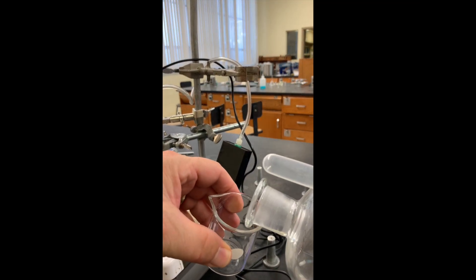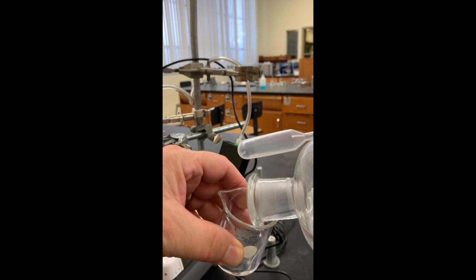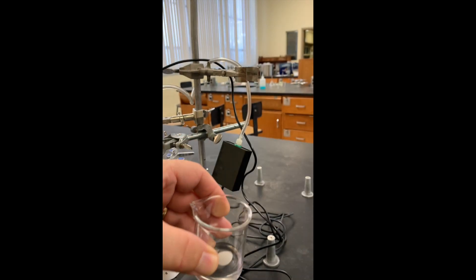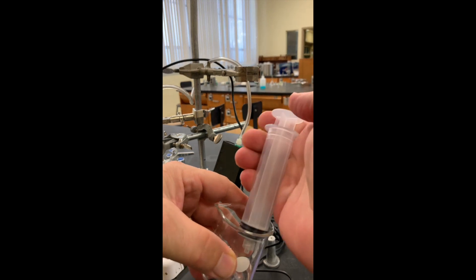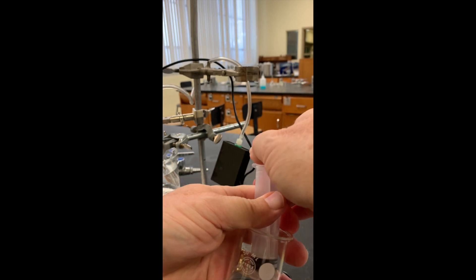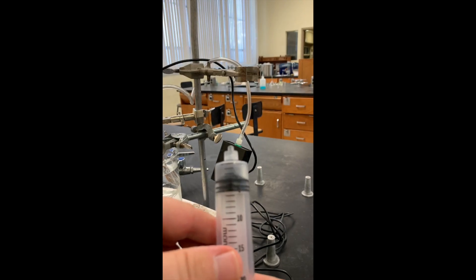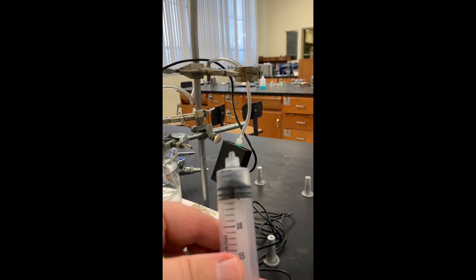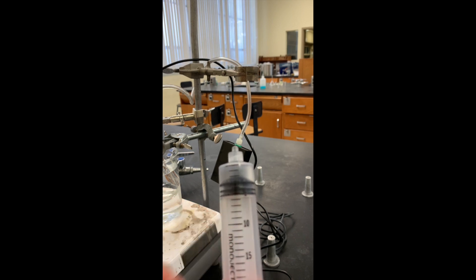This shows the addition of methyl alcohol into a beaker. A syringe will be used to get three milliliters of alcohol, and it looks like the top of the plunger is right on three milliliters.